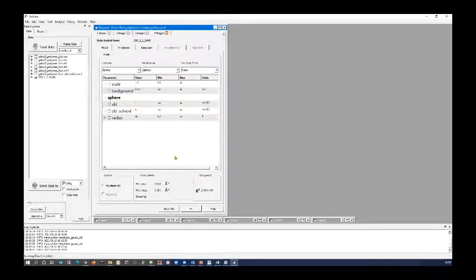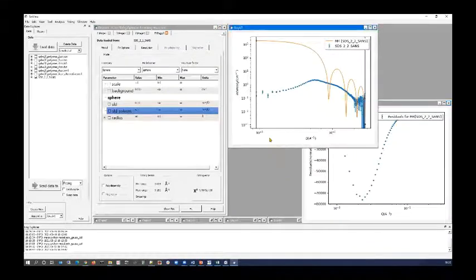So now we have some different parameters to what we had for the polymer data I was just showing you. And again, I have some priors. I know that the scattering length density of the polymer is about 0.33, and it's in D2O, so that's going to be about 6.3. So let's see what things look like.